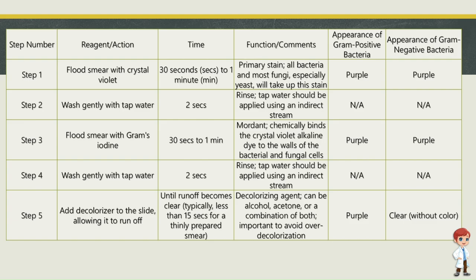Step 3. Reagent/action, flood smear with Gram's iodine. Time, 30 seconds to 1 minute. Function, mordant, chemically binds the crystal violet alkaline dye to the walls of the bacterial and fungal cells. Appearance of gram-positive bacteria, purple. Appearance of gram-negative bacteria, purple.